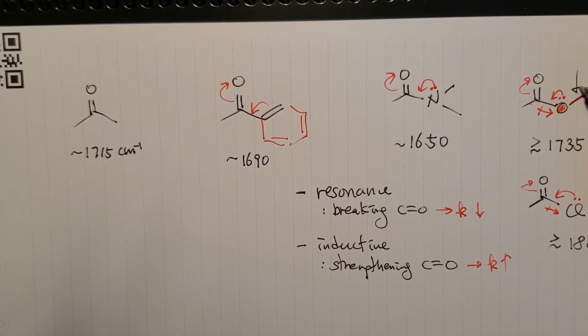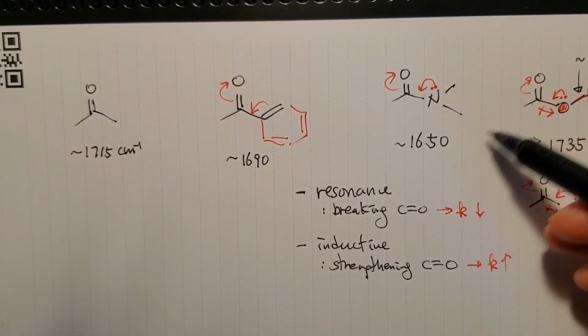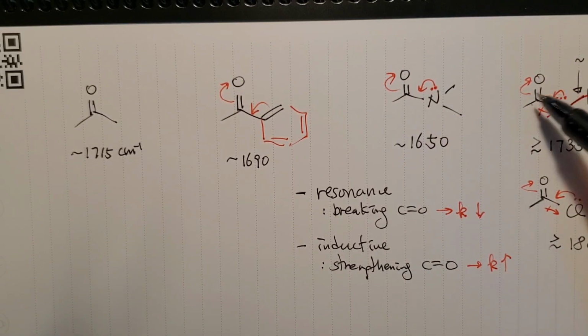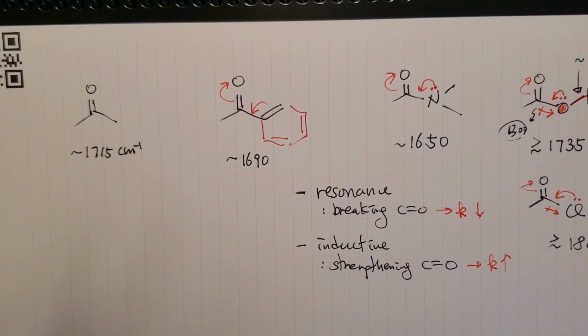Therefore, this number is almost always static, near 1000. But this one here can change, depending on what you have here. Anything here promoting more resonance by withdrawing electrons gives a more strengthening effect and more weakening effect here. So this single bond becomes a 1.5 bond. Therefore, this goes as high as 1300 and more even. I think I mentioned it in the beginning of the previous video.